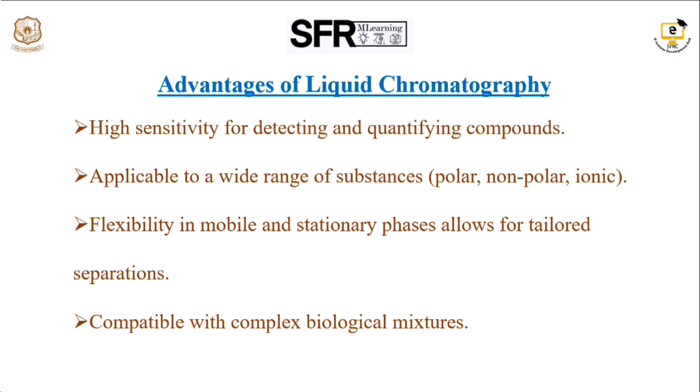Next, the advantages of liquid chromatography. It is highly sensitive for detecting and quantifying components, and applicable to a wide range of substances, meaning polar, non-polar and ionic substances. Flexibility in the mobile and stationary phases allows for tailored separation. It is compatible with complex biological mixtures.